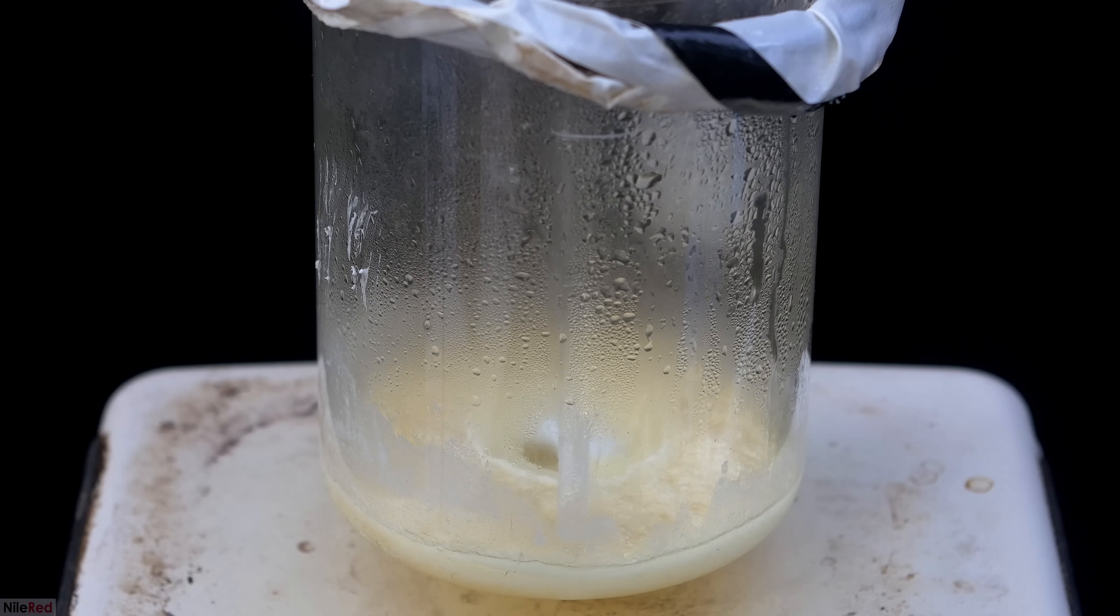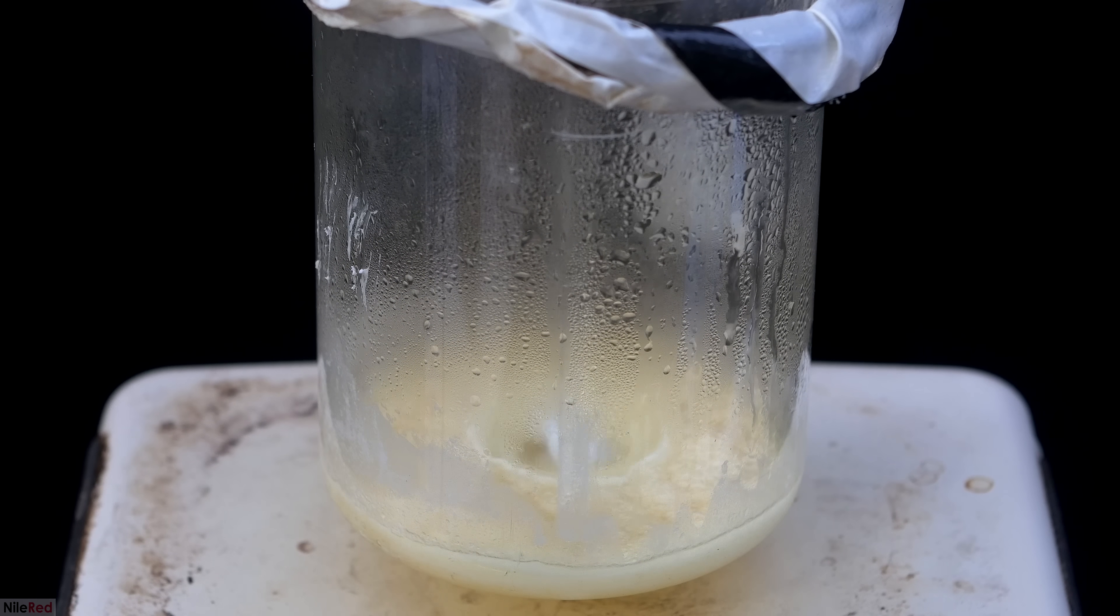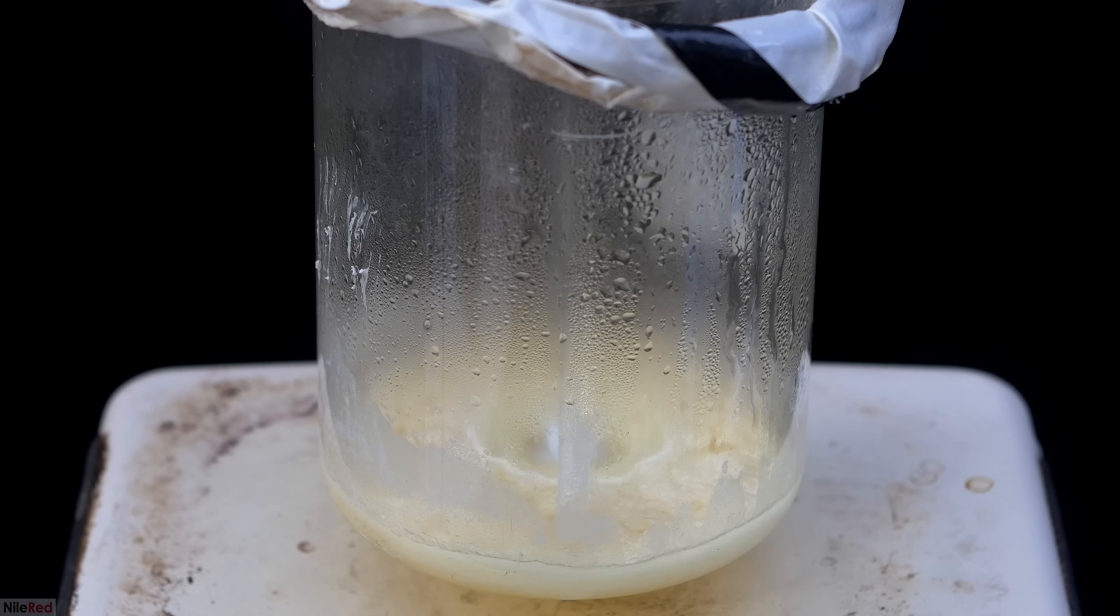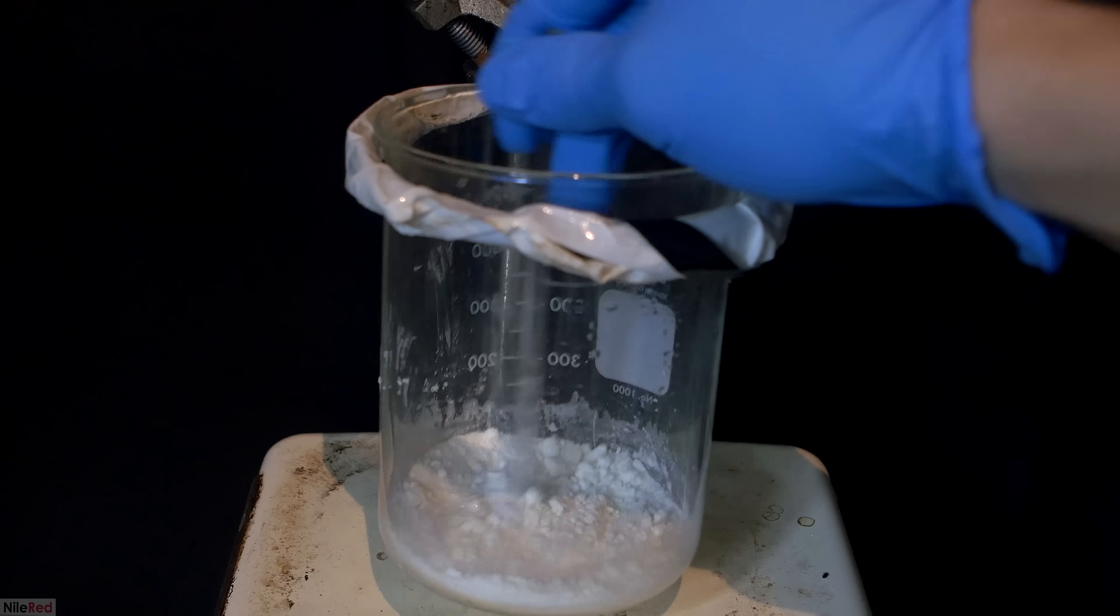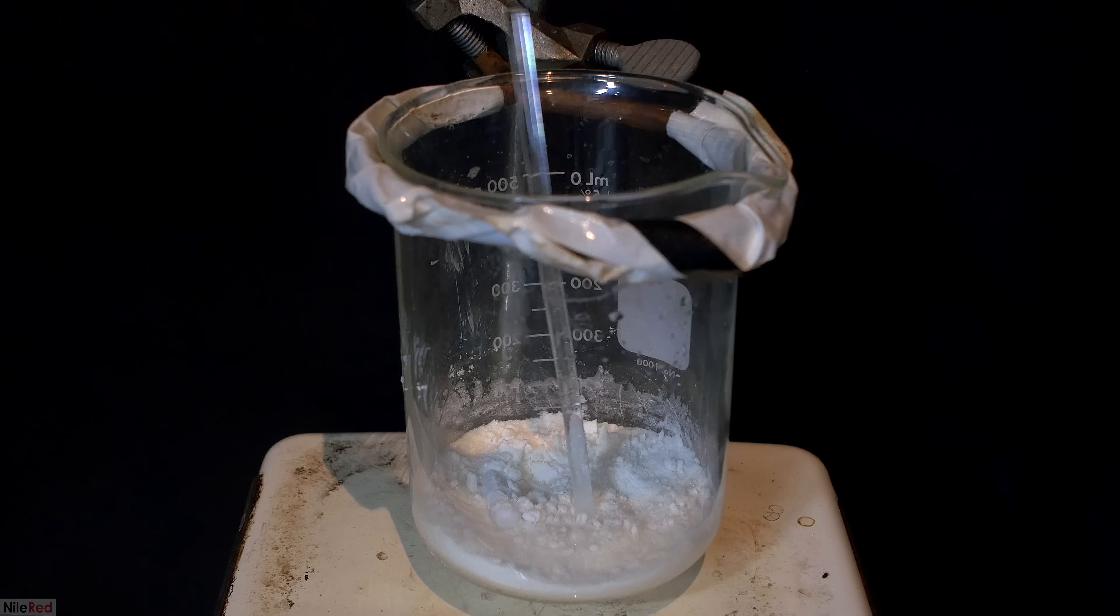As we get very close to getting rid of the last bit of water, some nitrogen dioxide gas starts to come off. Right now, it looks like things have a slight yellow color, and this is due to the nitrogen dioxide, but once we get rid of all of the gas, we should be left with a nice white salt. Eventually, pretty much all of the water is gone, and we're left with some nice white mercuric chloride.